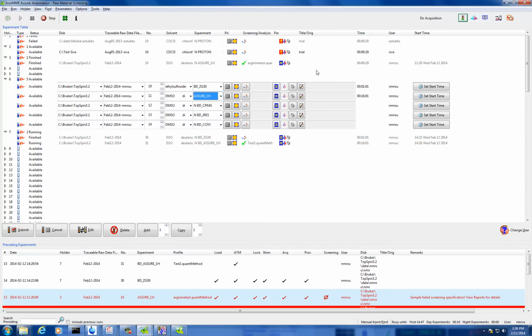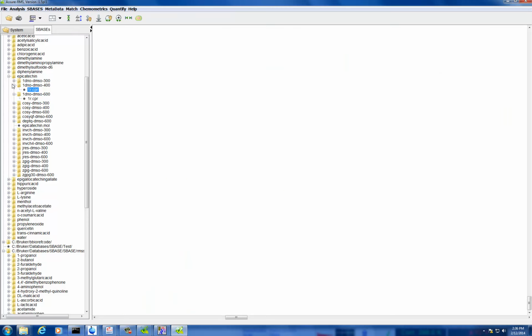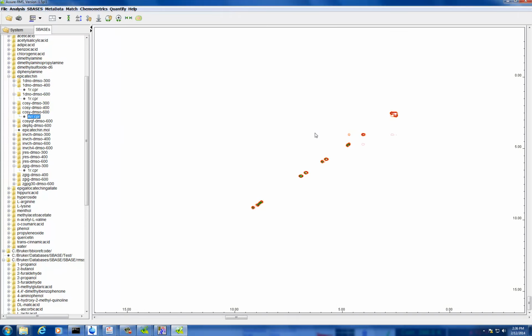If you start to run your cranberry and you have 2D, then you can do the exact same thing. Drag in your 2D in here, and then drag in DMSO. Then you can drag your 2D in as well and see if it matches. You know what I mean? Now you only have 1D, so you can only use the 1D. Okay, that makes sense.